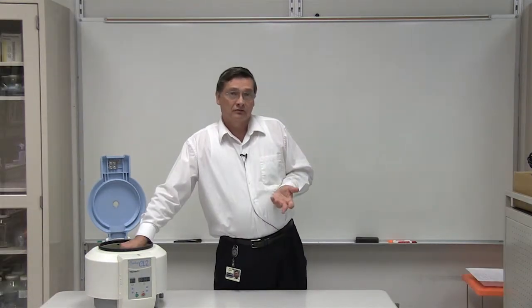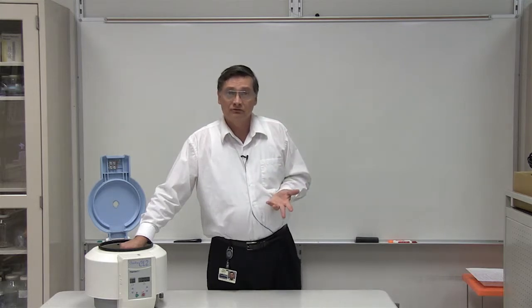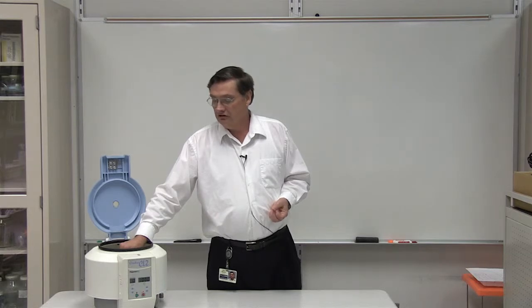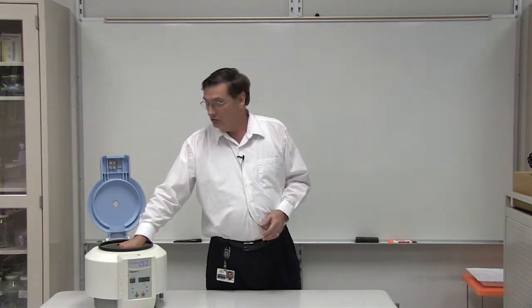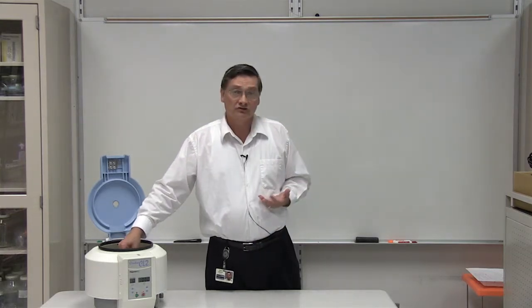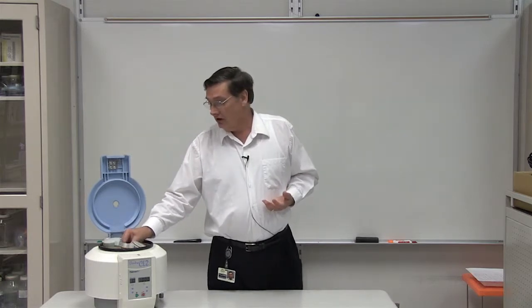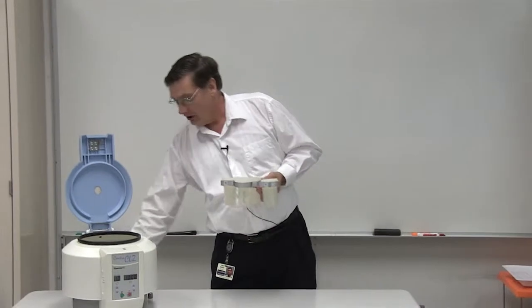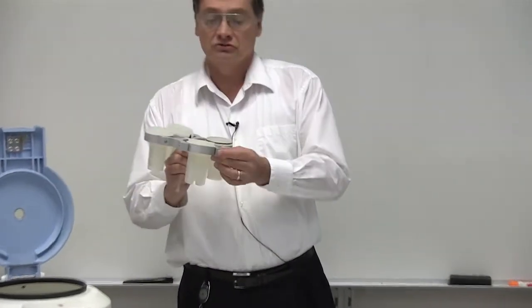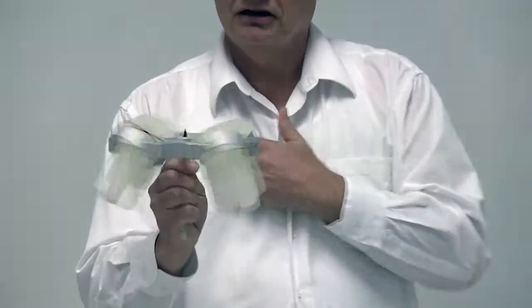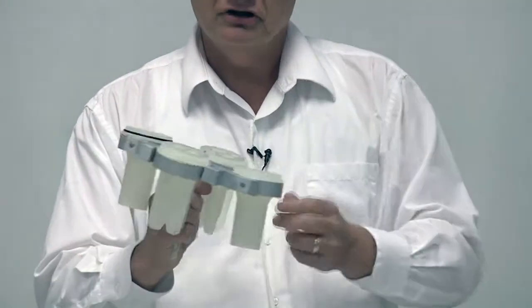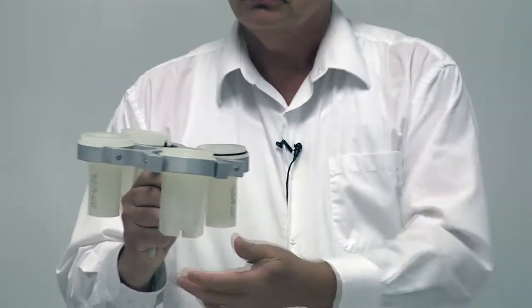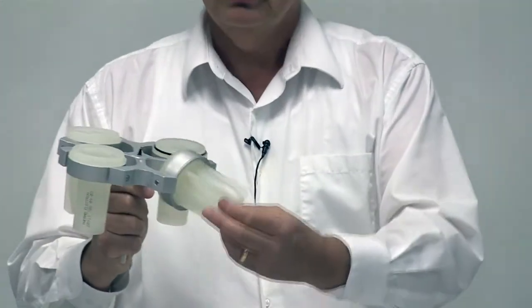Despite the fact that there are hundreds of different types of centrifuges, they have a common element in their function. They're basically a motor which drives a spindle on which is attached the rotor. The rotor would have our samples on it, and these would spin. As they spin, the increasing amount of force puts force on the tube.